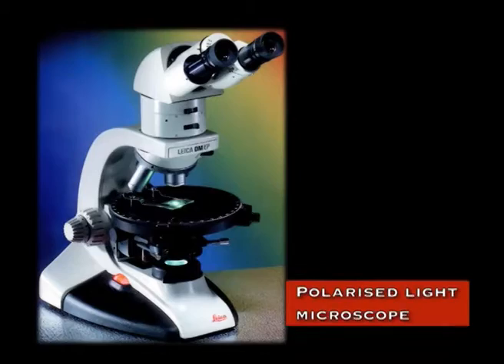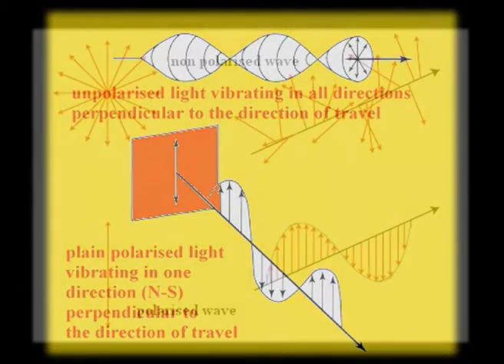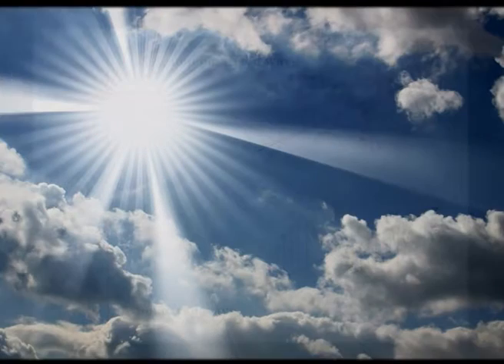The next type of microscopy which I am going to discuss is polarized light microscopy. As the name suggests, polarized light is used to illuminate objects. And what is the importance of polarized light and what is polarized light? Polarized light is light where the electrical vectors vibrate in a particular direction, compared to unpolarized or non-polarized light, a good example of which is sunlight.